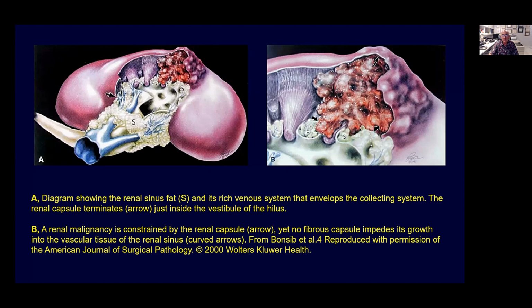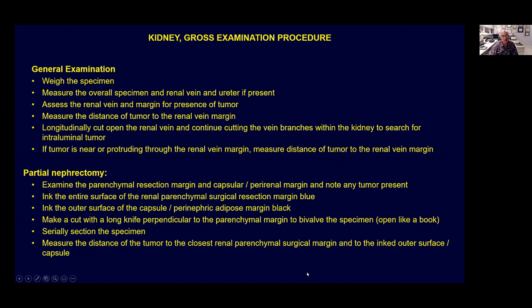So we need to correlate or at least reconcile in some way. And many times, if there is some doubt, let's use some kind of more intermediate words like suggestive. It appears like, but it's not definitive, or something like that. Okay, so that is going to be an important feature in your examination.